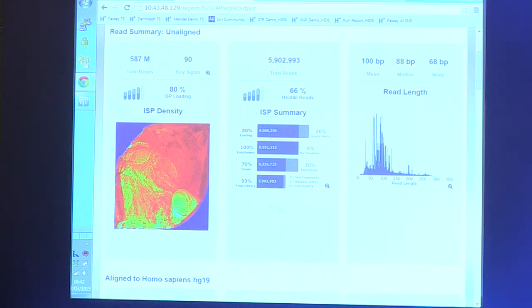Moving on to the last one, there's a few final filters that occur. Again, the text might be a little too small to read, but various types of low quality and control fragment are taken out. And in the end, we're left with 5.9 million reads that reflect our final sequenced library. So this is our desired and final result. It's DNA that we have sequenced that is of sufficient quality to go on and make further analysis with. And this is the number reflected at the top here, just over 5.9 million reads, 5.9 million wells on the chip where we have got usable DNA.